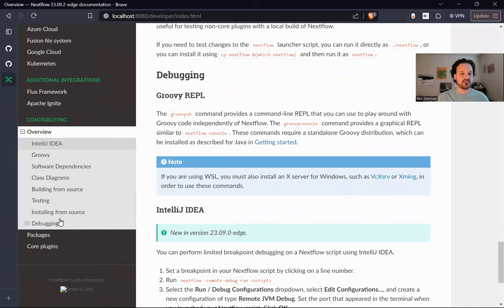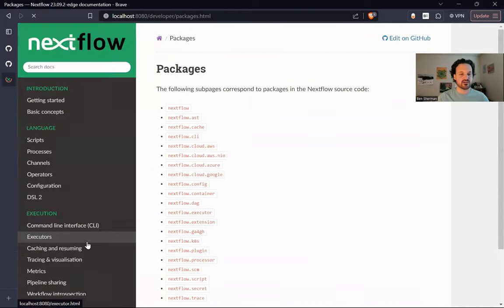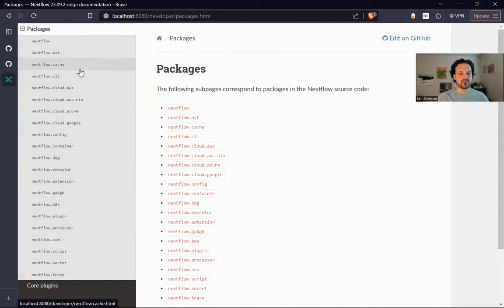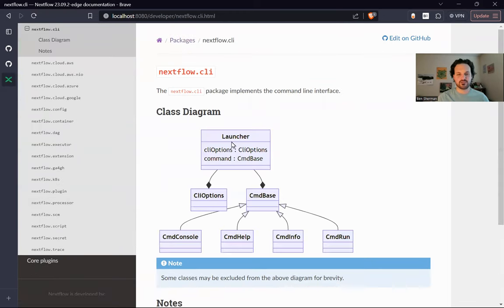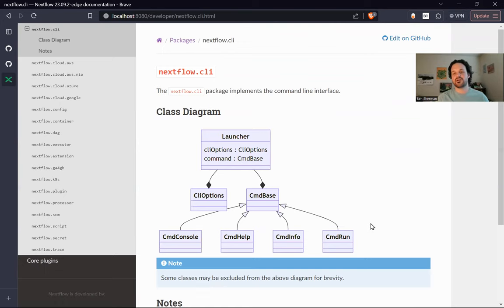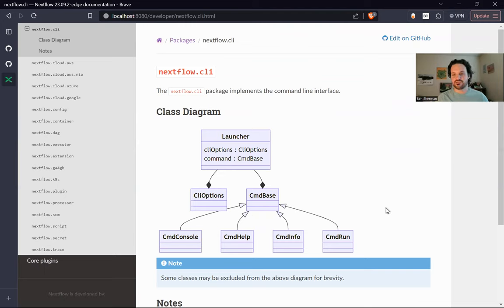And then I've got these class diagrams here. So for some of the major packages, we've tried to build some class diagrams just to give you a basic, sort of like a high level overview of the code base, which can maybe help you figure out like, okay, I'm going to work on this particular feature in the NextFlow code base. So I'm going to go find this group of classes.